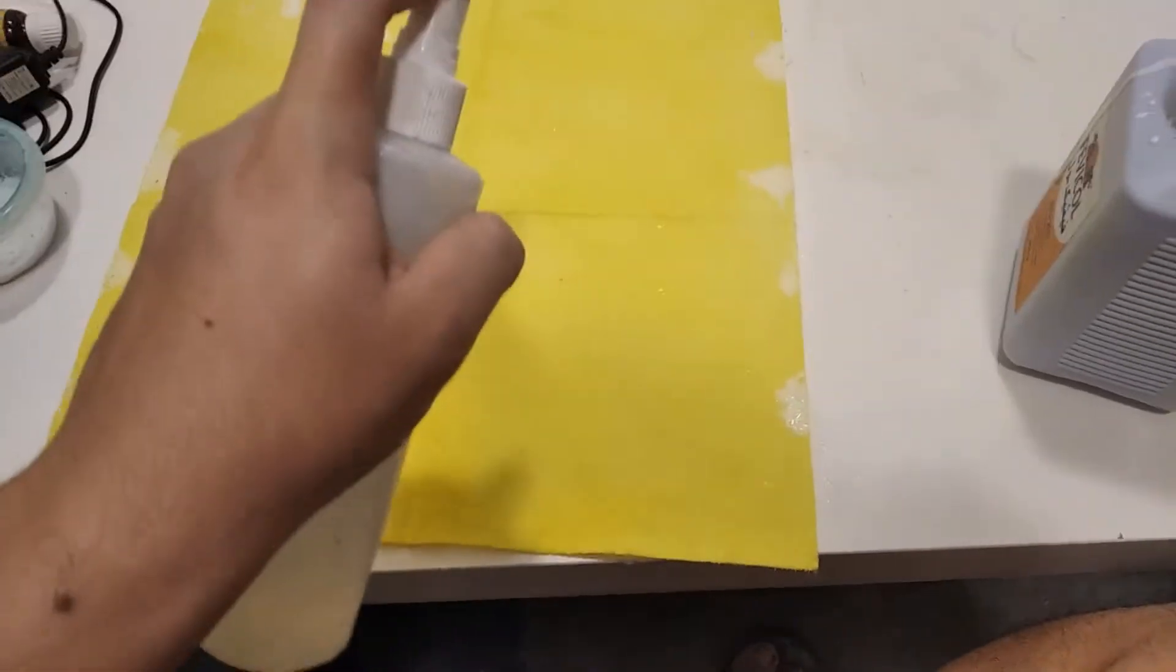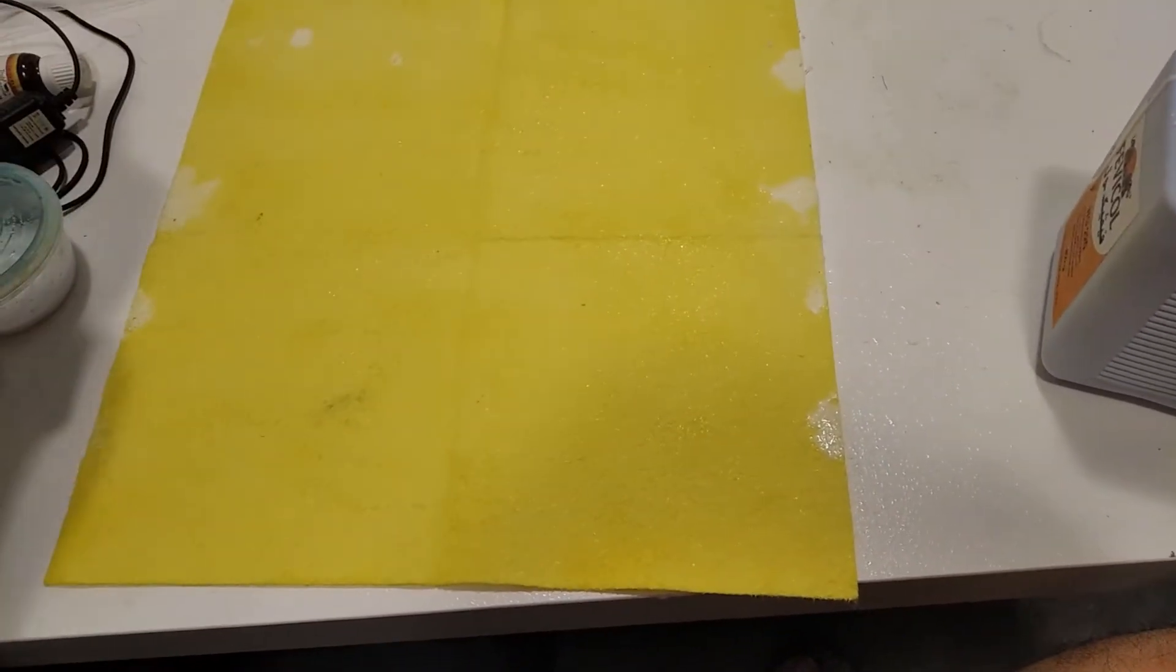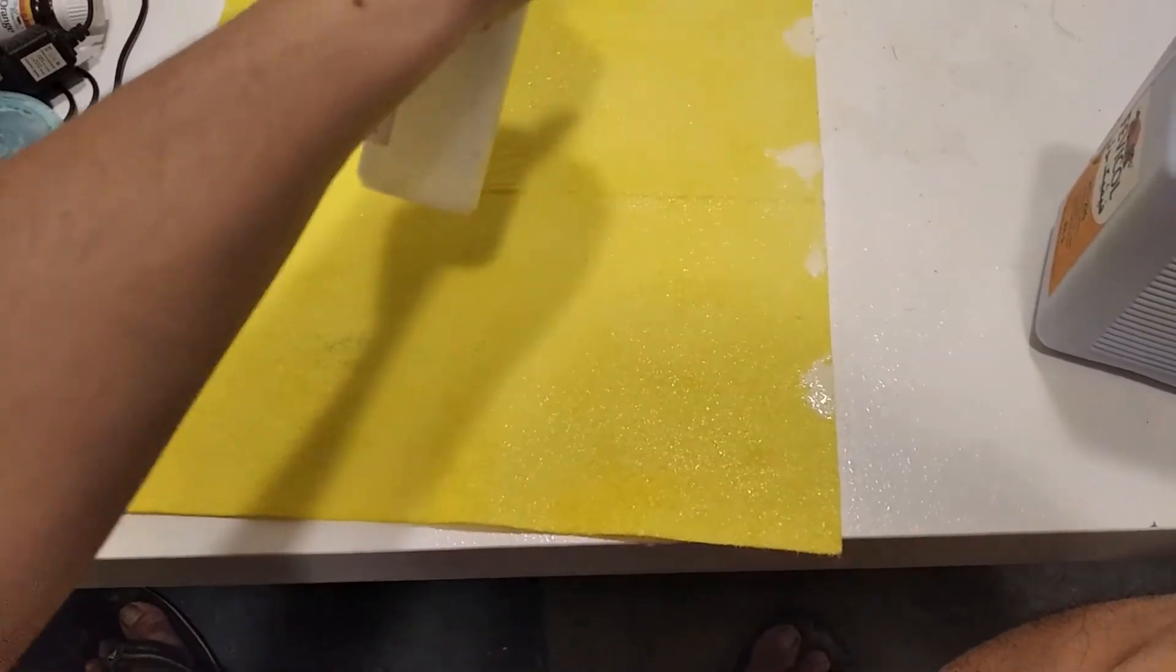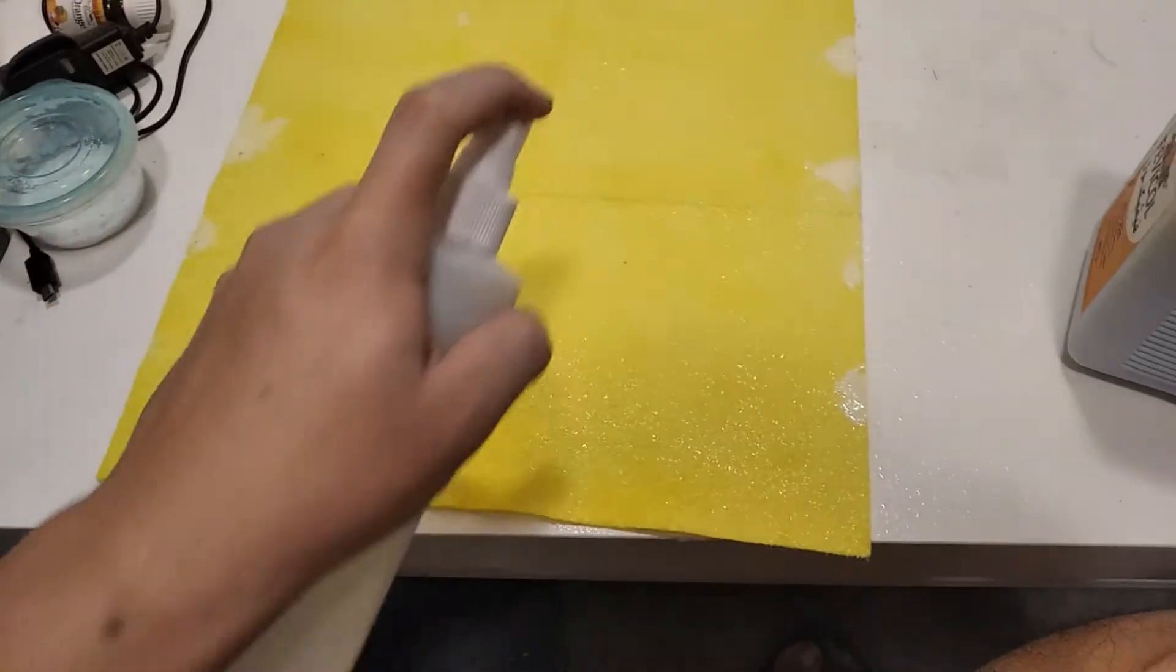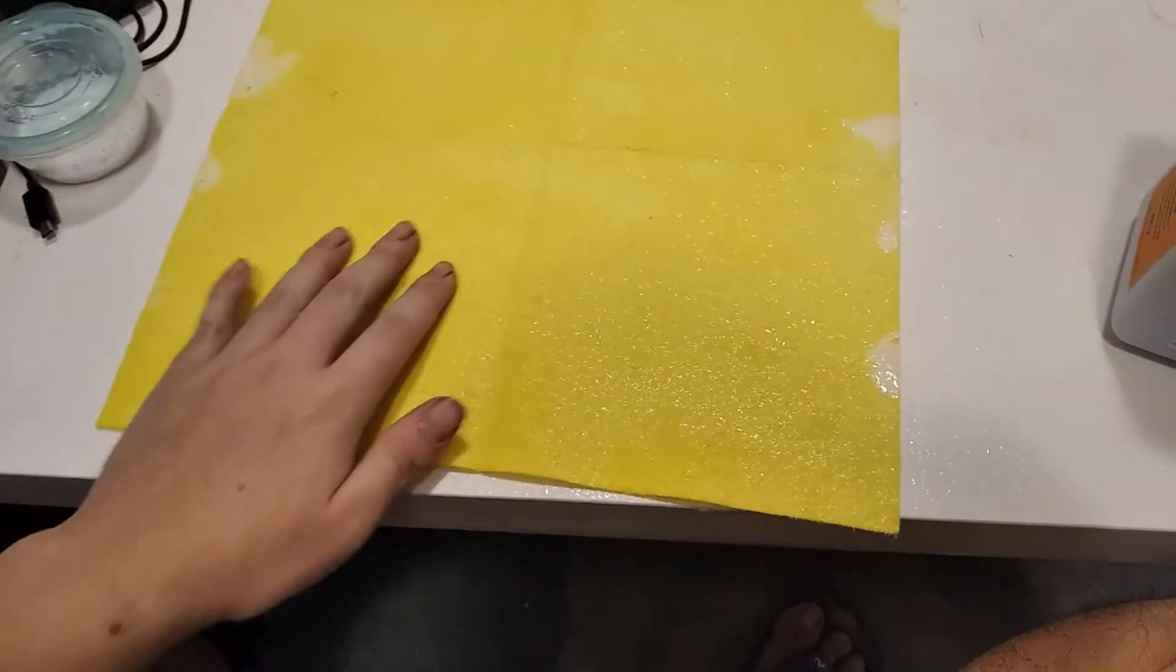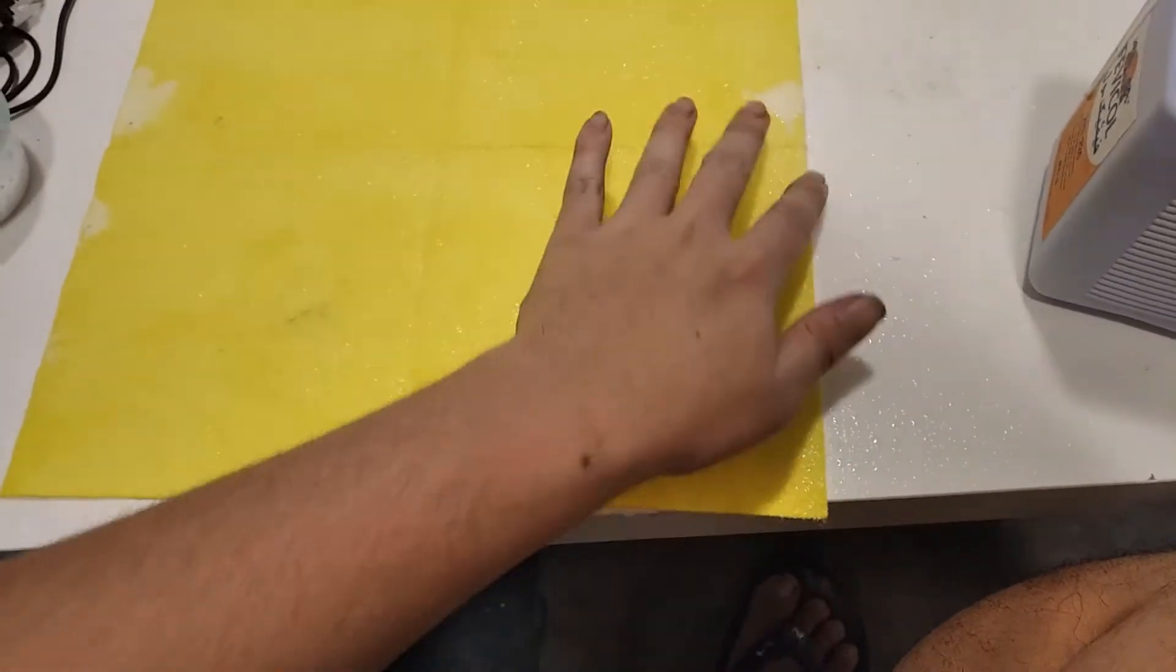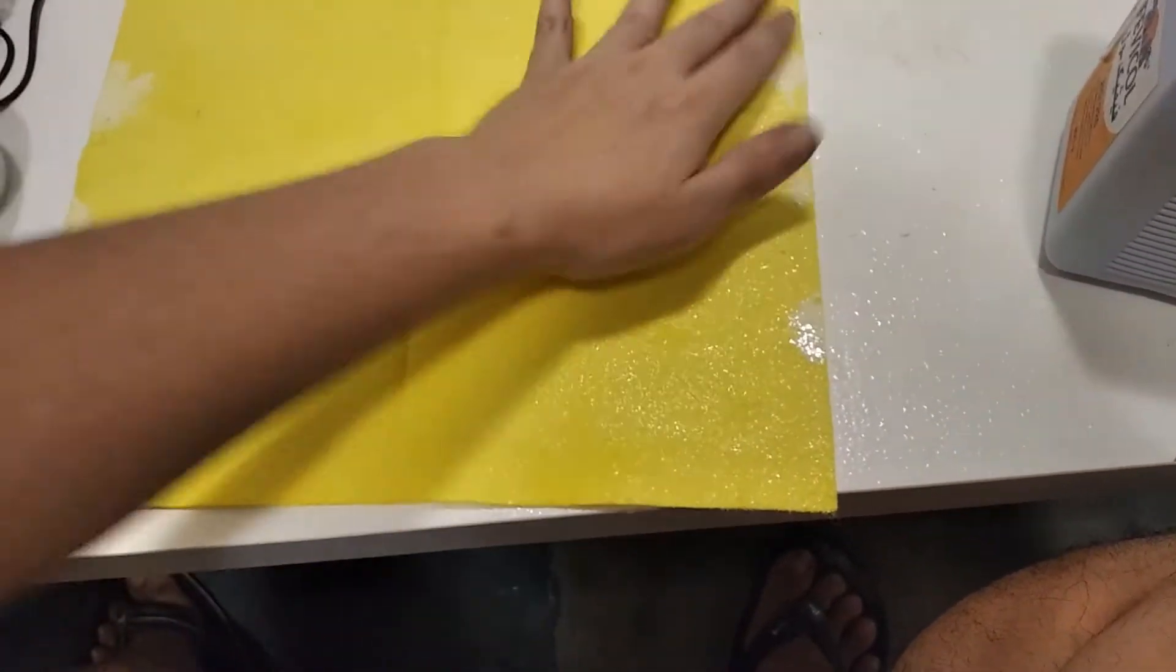As you can see, you're noticing that it actually turns clear. That's because you're cross-linking the borates using borax. You're cross-linking the PVA with borates. Now you can touch it. It's turned into some type of gel, which is what you want.